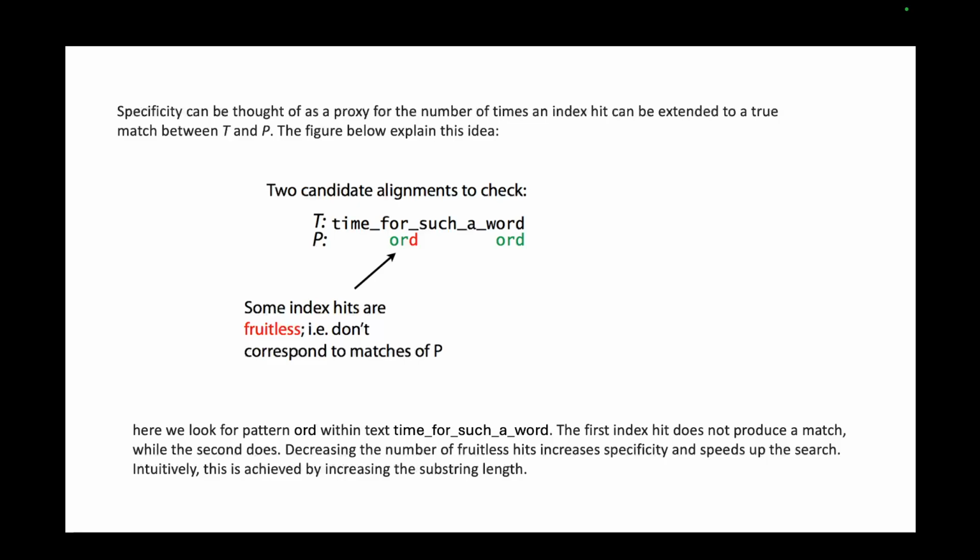This is not the whole pattern, the whole sequence that you're trying to align. So these are substrings, and you would want the exact match. In the whole sequence, you might not have exact matches, but for the substring at least, you would want as many exact matches as possible.